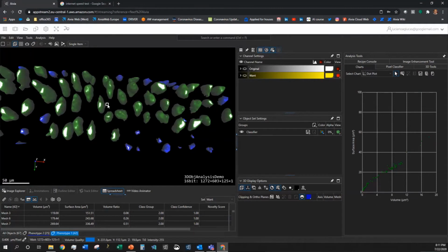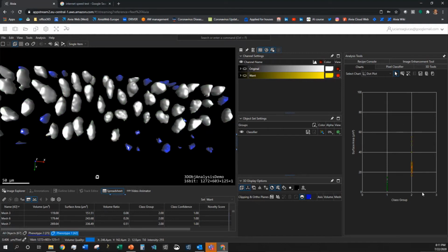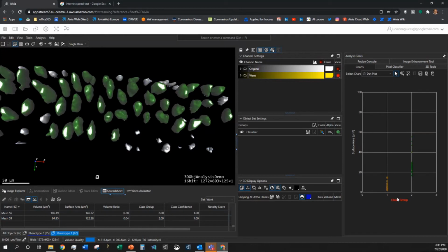Okay. All right. So I have classified, and I have the subtabs down here with the classes, and it's even possible to see in the spreadsheet as well. So I can classify by group. I can set this to 0 and this to 3 so that you can see the groups. So they are visible here. This is one group, this is the other group, and you can also see how confident we are per group.